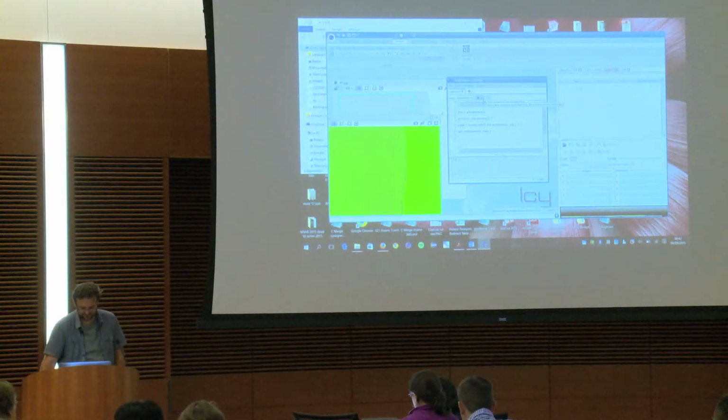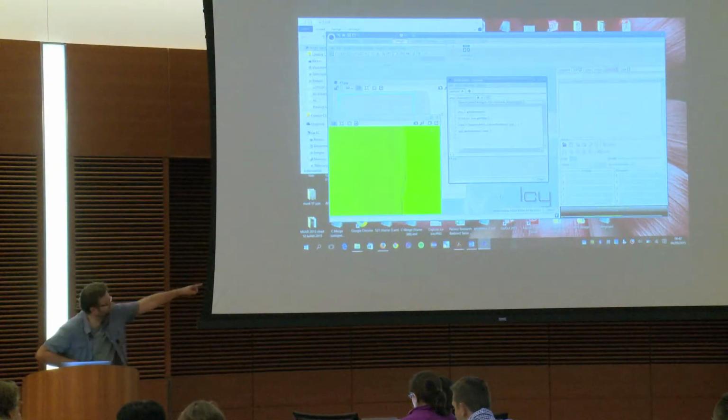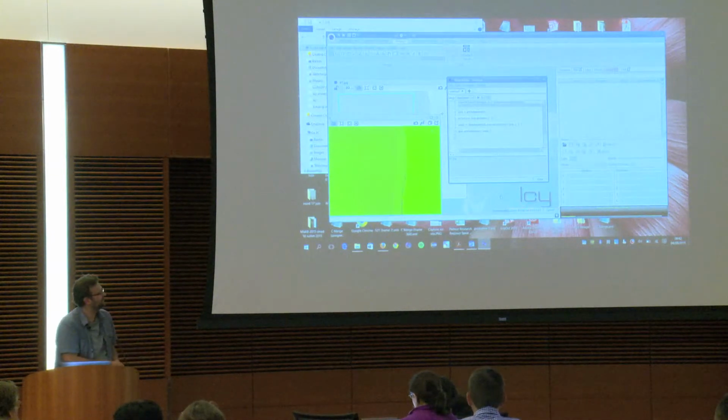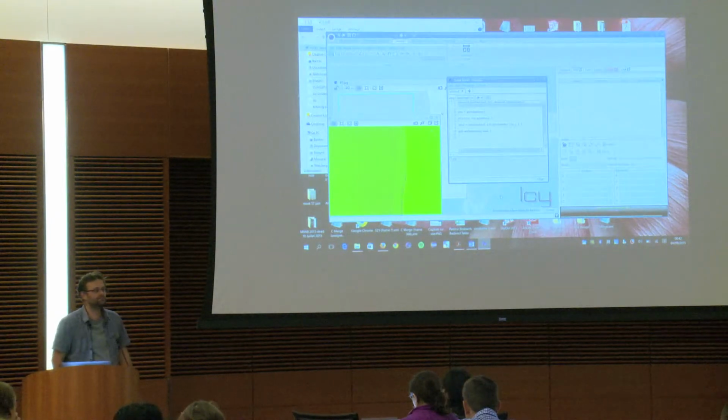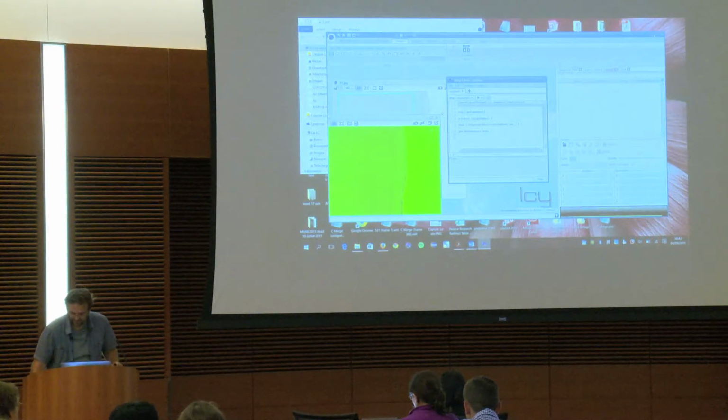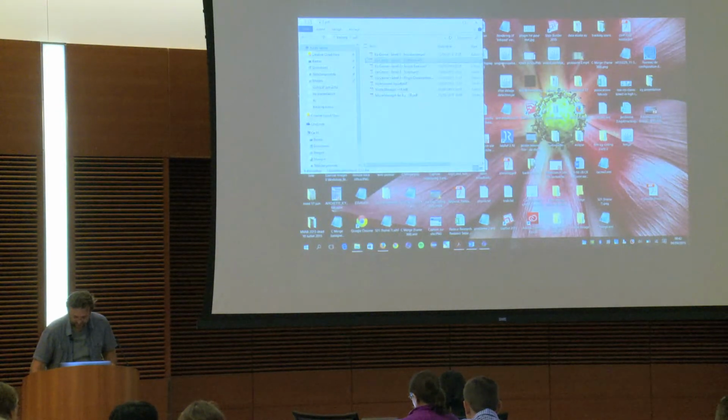Jython for IC. So it's downloading it. You see it here. So I need to wait a little bit because there are dependencies. But when it's finished, in here in the list, I will have the Python. And if you want to add another language, you put it as a plugin, same thing, and you will have it in the end. Okay, but here it's downloading 10 things because there are a lot of dependencies. And that's all.